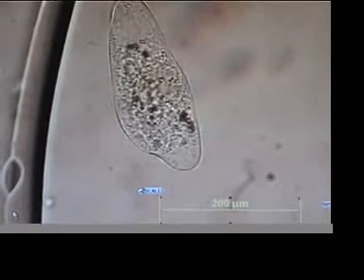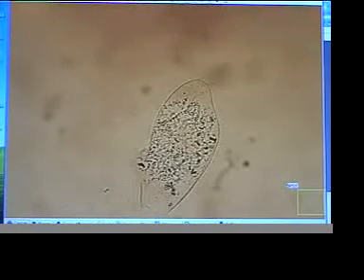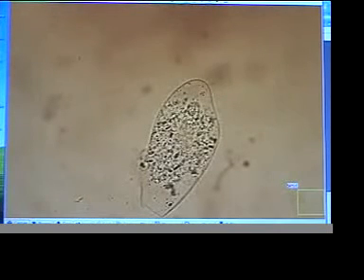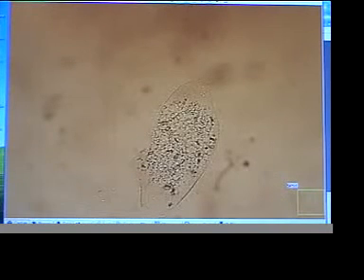Being pushed across the stage by the microscope by an air bubble. And this is the remnant of another paramecium on the same slide who also underwent destruction. We'll change the focus a little bit. Seems to be venting. Sorry, the computer went to sleep. Seems to be venting material on the left side of the organism there. You can see that. A little tricky to see.